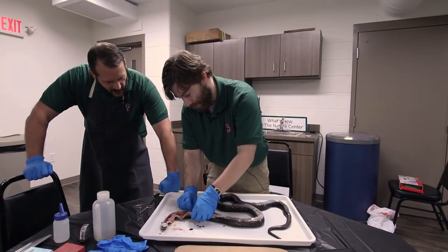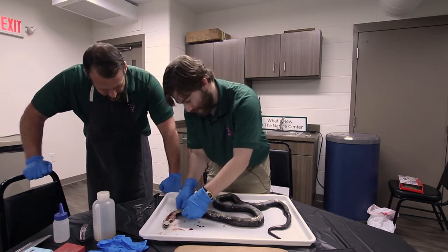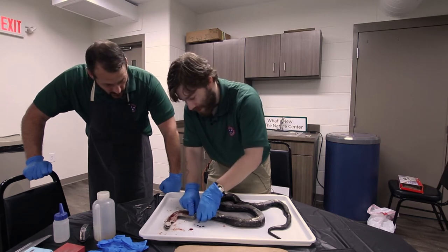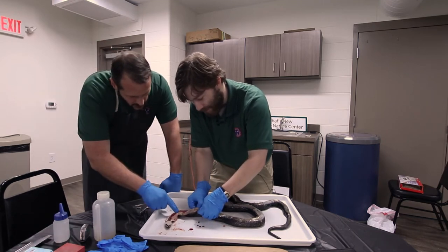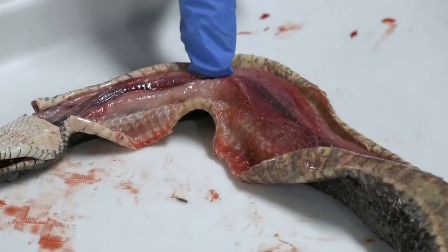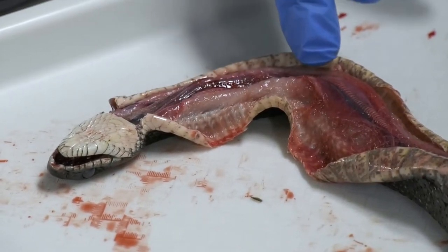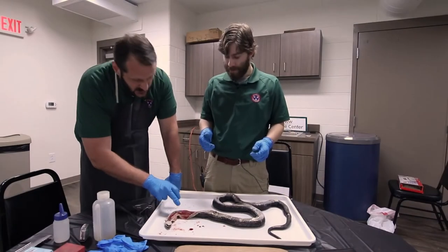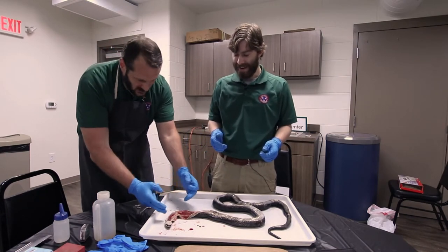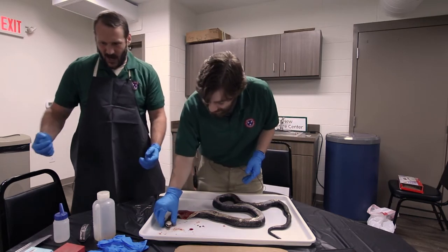All right, so straight out of the gate, I'm seeing some respiratory anatomy, I believe. Am I right? So there should be a trachea in there somewhere. I think I'm looking at it. Should be an esophagus somewhere. This right here, it looks like the cartilaginous rings. So we should have the trachea here. That looks an awful lot like mine and yours, except it's much longer proportionally. Not just proportionally, it's actually longer than our trachea, even at the same scale.